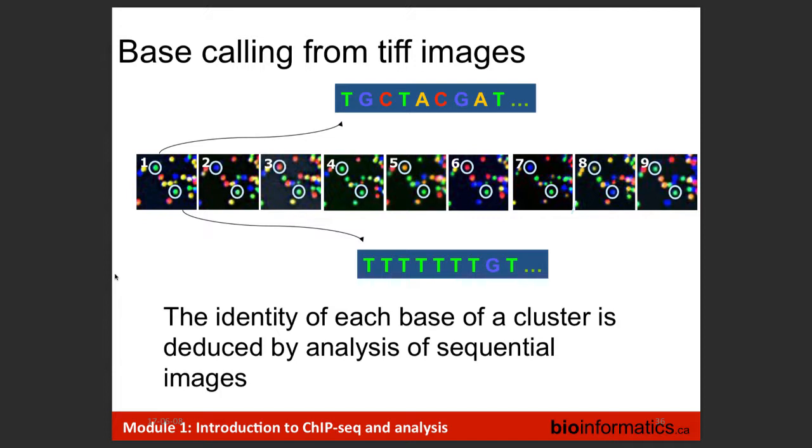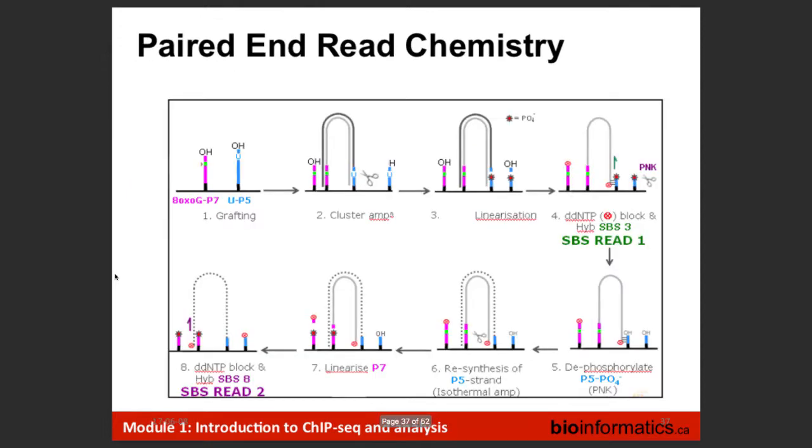So why is it that we can only read 100 bases? That gets into something called phasing and prephasing, which is one of the failure modalities, and hopefully that will become apparent as we go through that. But yes, biology is not black and white. There are misincorporations, and the chemistry itself can be problematic, and I'll talk about that in a minute.